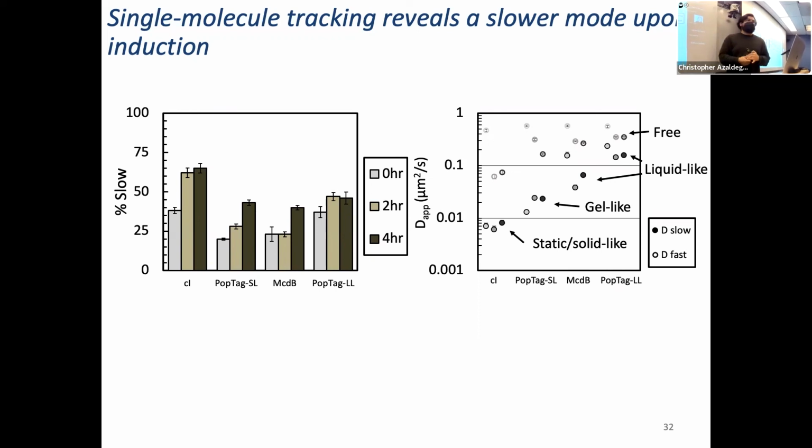As you can see here, there's quite a nice trend of these diffusion constants demonstrating the dynamics of these proteins. What's really cool is that when we compare that to what you show in your single particle squiggly line plots, even though you still have fast diffusive long tracks, you're still getting liquid phase separation. Yeah. I'm arbitrarily fitting it to a two-state model for consistency, but I assure you that if I were to fit a one-state model, you get a decreasing trend of diffusion constants, which would be indicative of the confinement due to this phase transition.